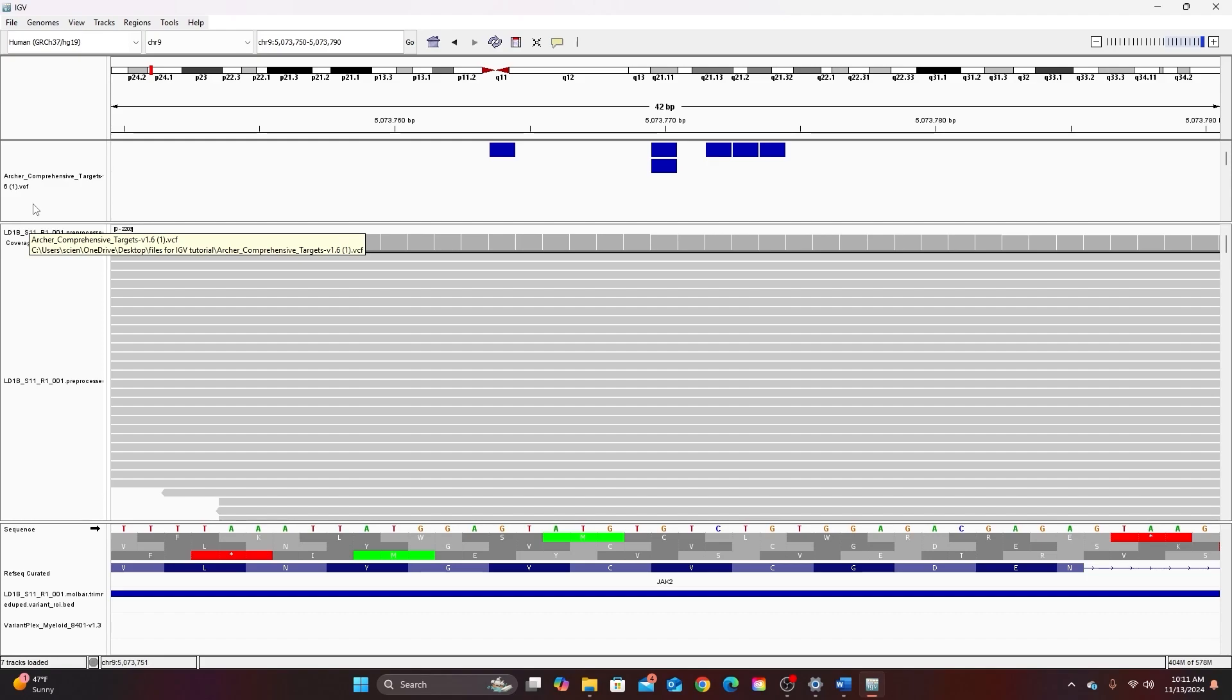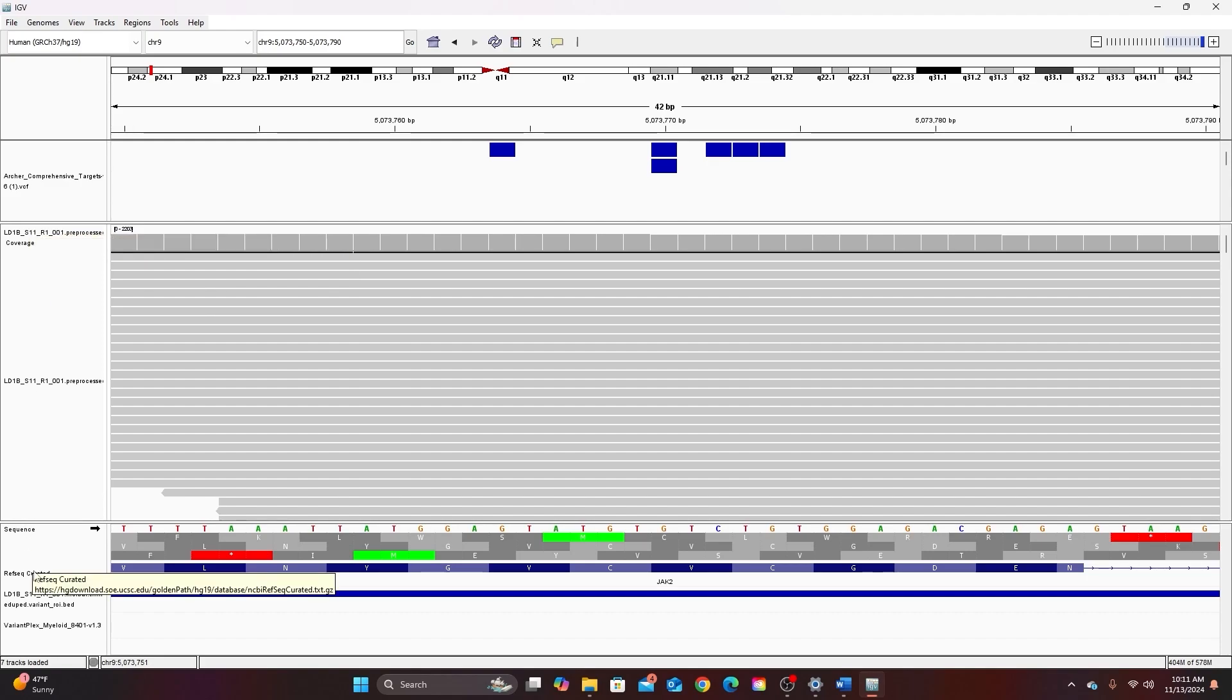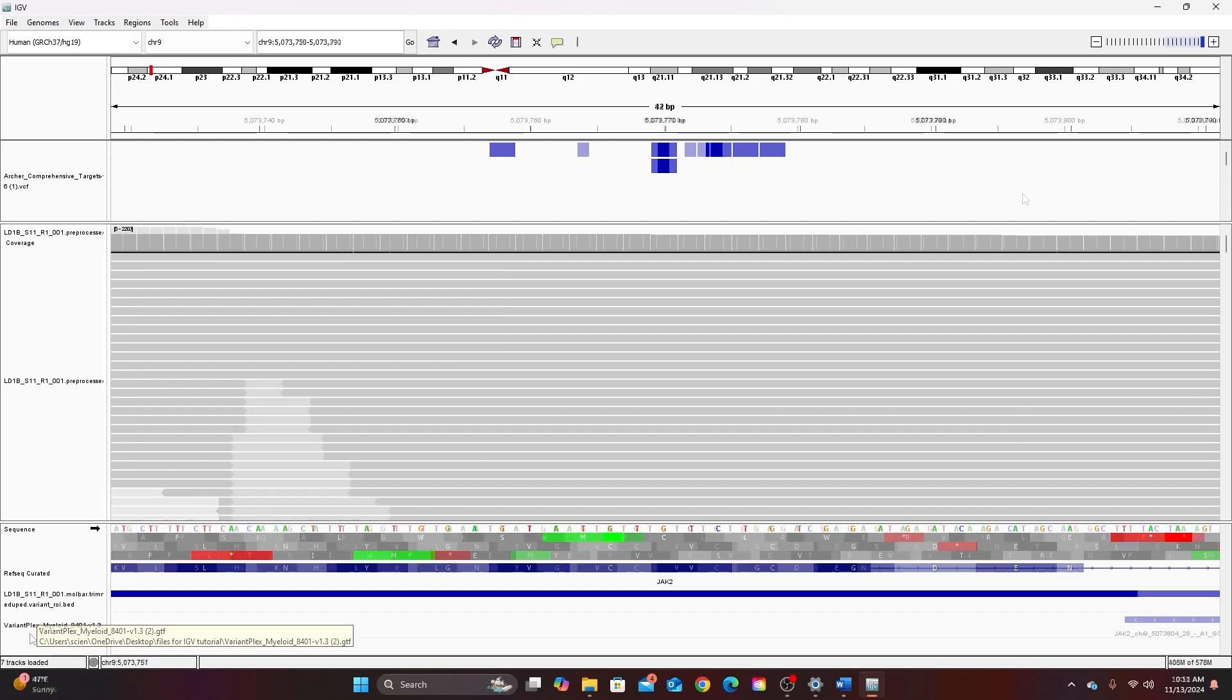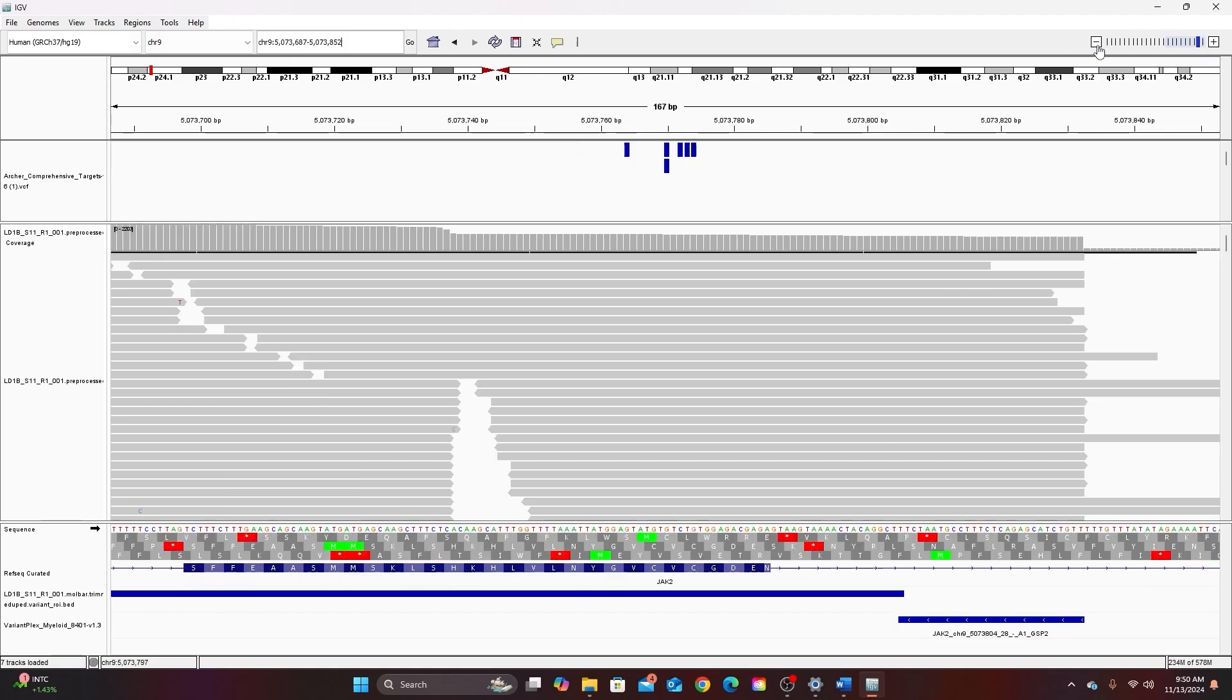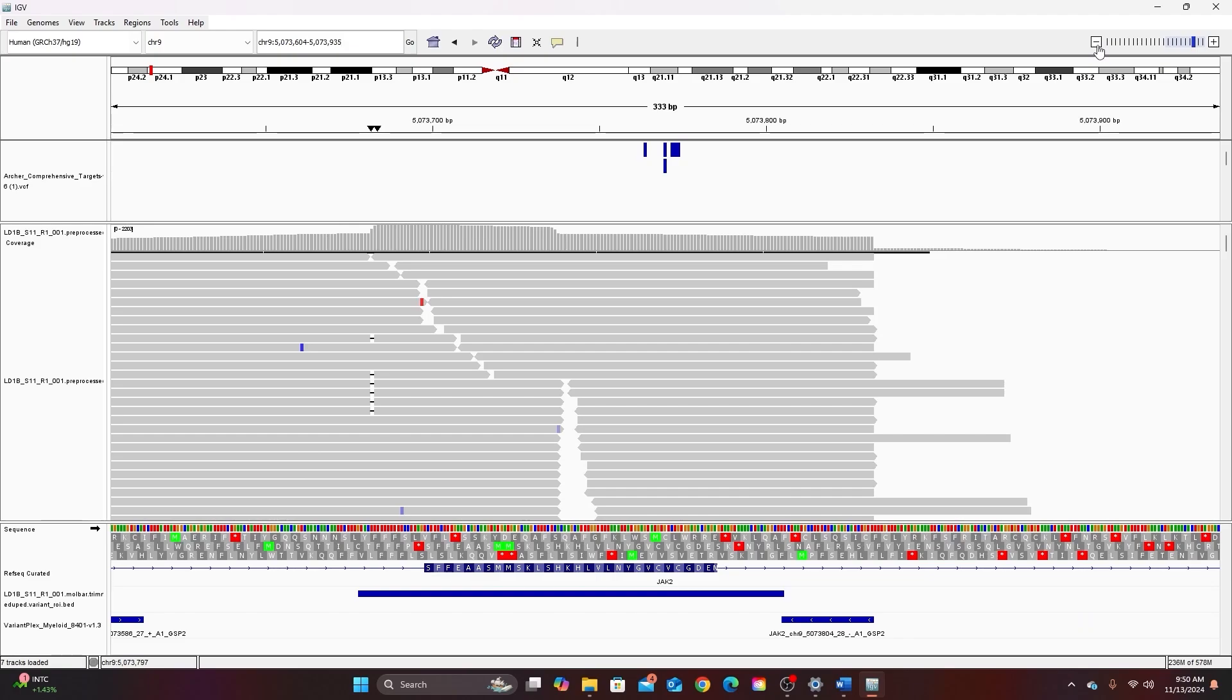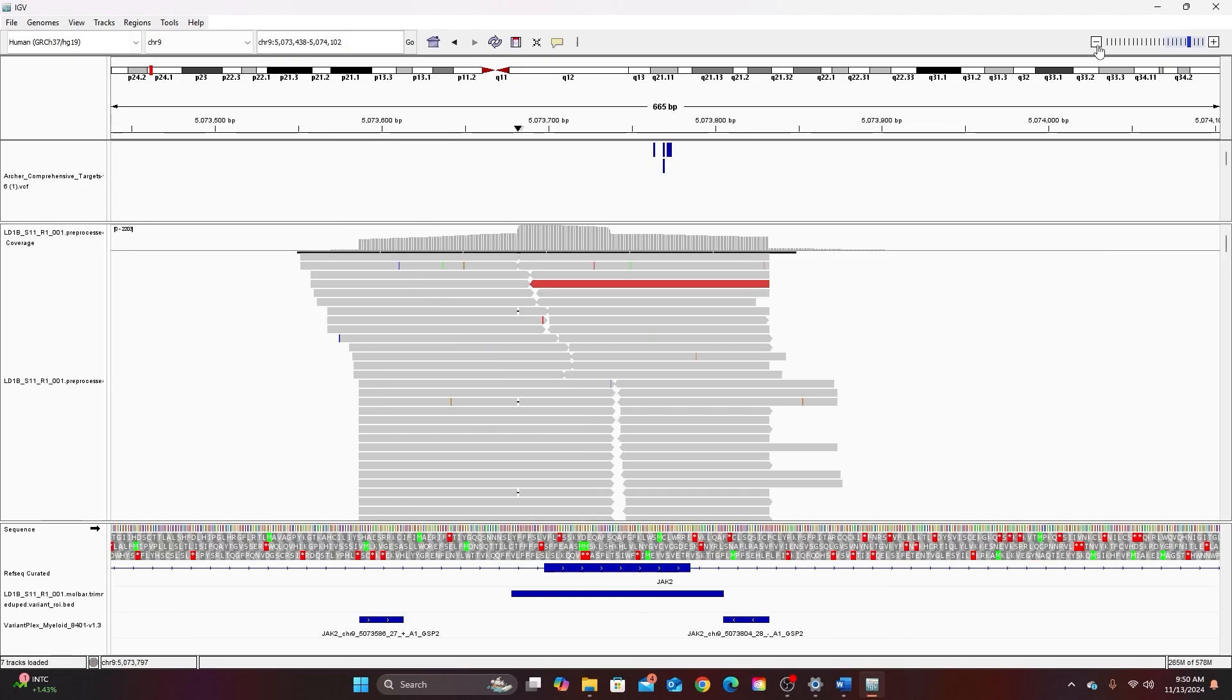In video two I describe each of these different data files in detail so I'm not going to describe them here. The reference genome is listed down at the bottom here and I'm currently zoomed in enough that I can see the translation or the list of amino acids for this part of the reference genome. If I zoom out I wouldn't be able to see that.